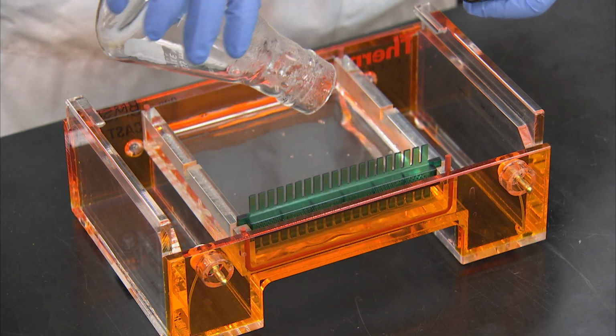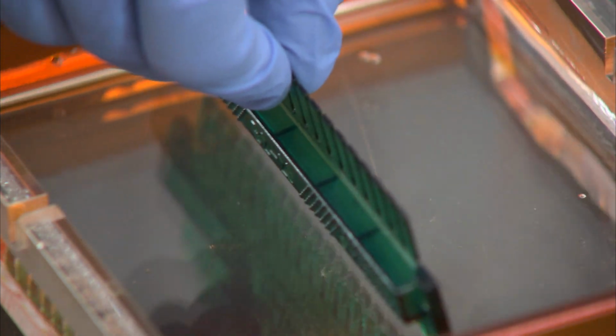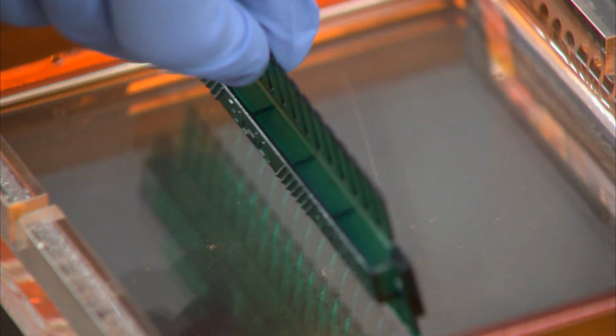If there are any bubbles, they may be broken or removed by the comb or a plastic pipette tip. When placing or replacing the comb, make sure no bubbles are trapped between the teeth, as these can make oddly shaped wells.